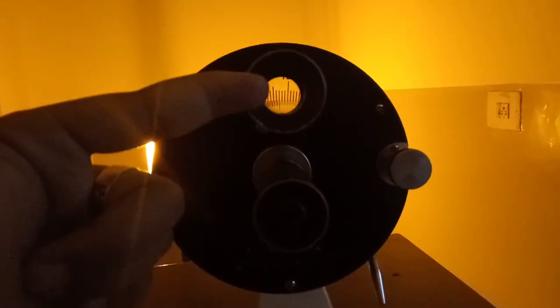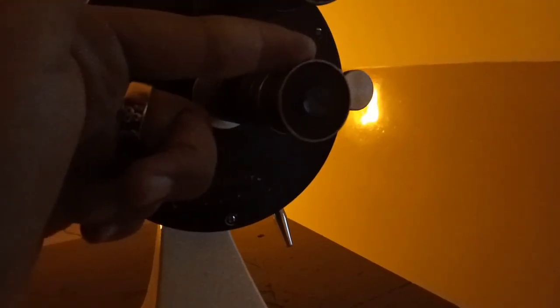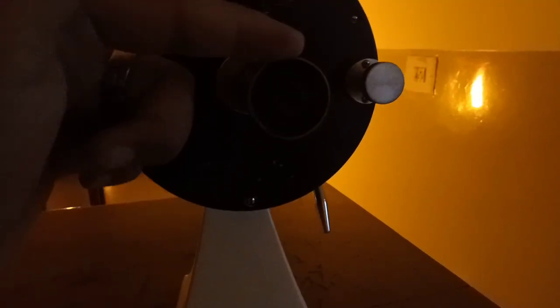Here we will be placing the sugar solution tube. Then another Nichol prism will be found here, and finally here is the eyepiece through which you can observe the light. This Nichol prism is the analyzer, the one present after the sugar solution tube. Here you can see two eyepieces. The first one is to view the circular scale and take readings precisely, while the second one is to view the plane polarized light, which the analyzer, found inside, sends towards the eyepiece. This is the eyepiece that you will be observing the light through.